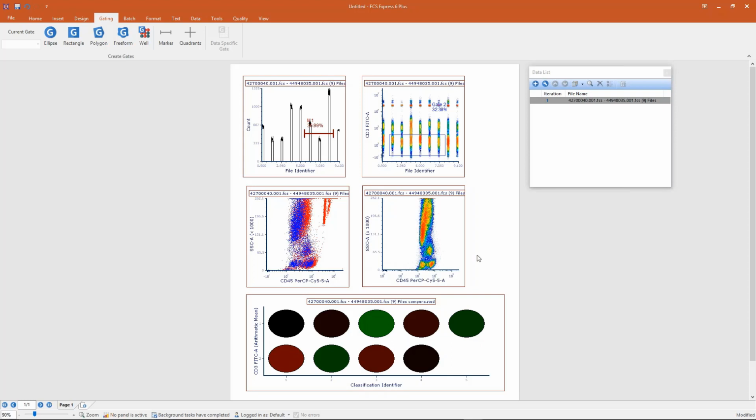Were there any questions on this basic set of features with the merged file, how to generate it, or anything specific that we were interested in here before I move on?